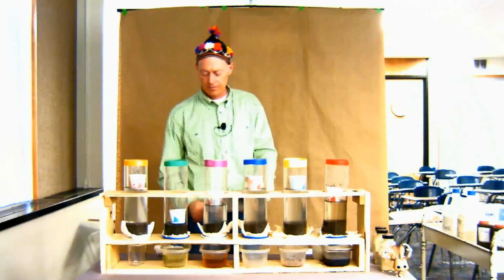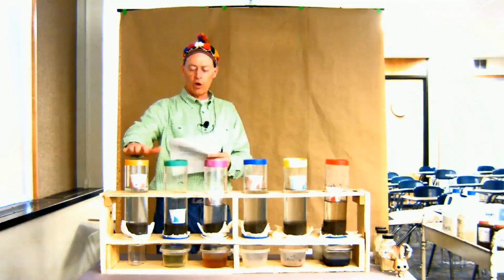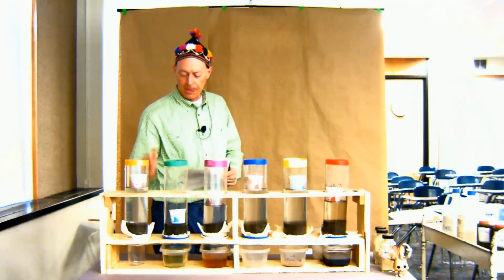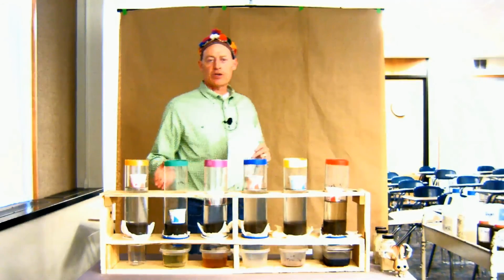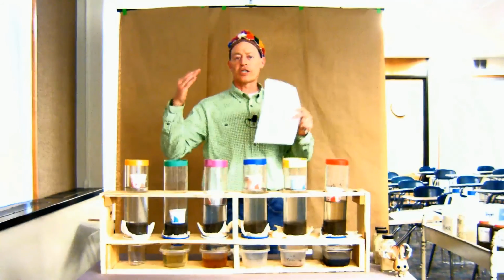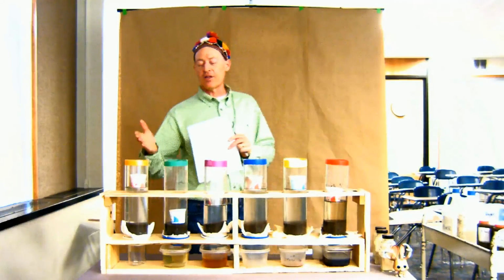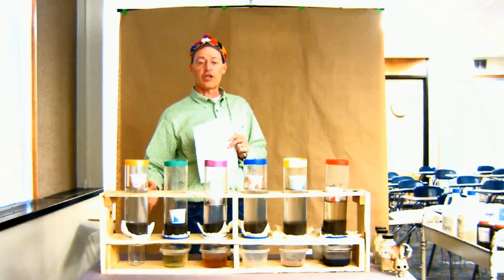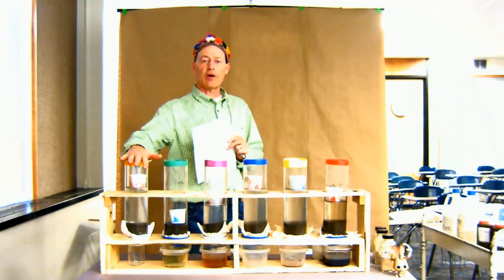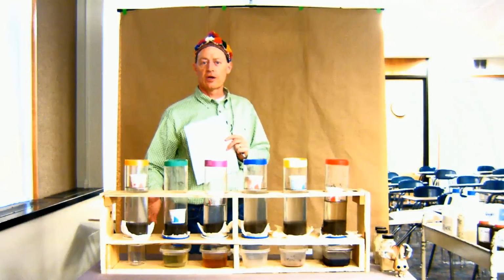Okay, recap. So we have a high SAR water, low electrical conductivity. This water has not moved. This is exactly like the pictures I showed where the water just sits in the field and does not drain. Okay? We can leave this here, literally, figuratively, however you want to think about it, for years. If we stop the evaporation from occurring, we can come back here for this class next year.